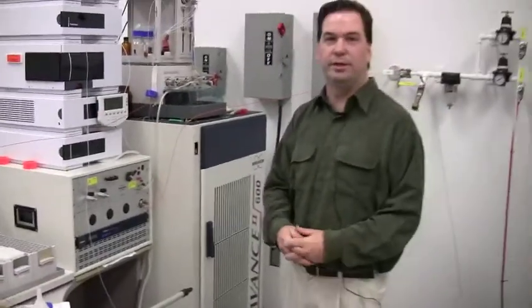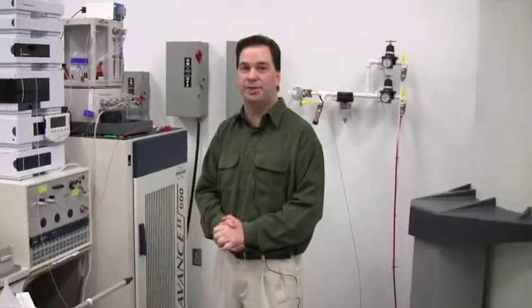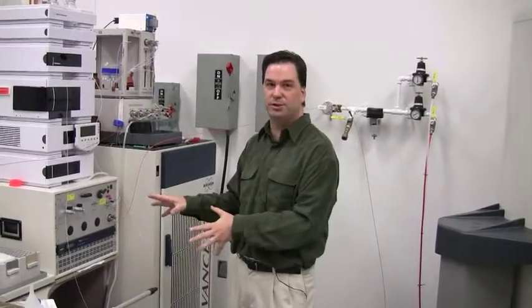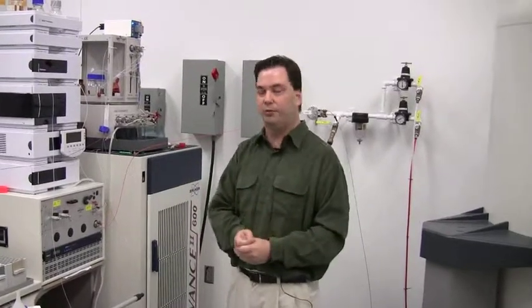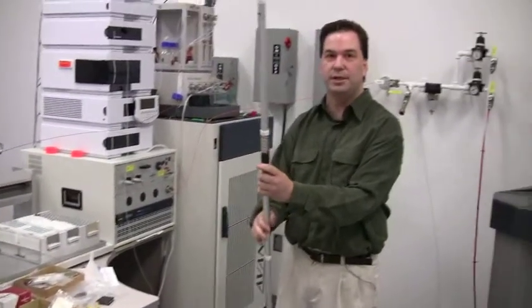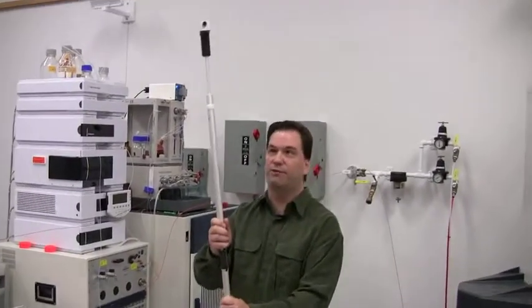Applications for this would be the case where you have a sample that is not very stable, something that's going to decompose in an hour or so. We could go directly from the HPLC to the NMR in real time. And this is accomplished by using an insert into the NMR spectrometer, which is essentially a flow cell.